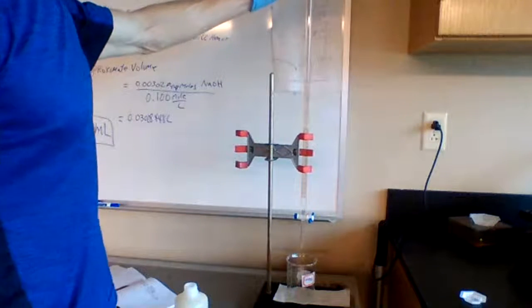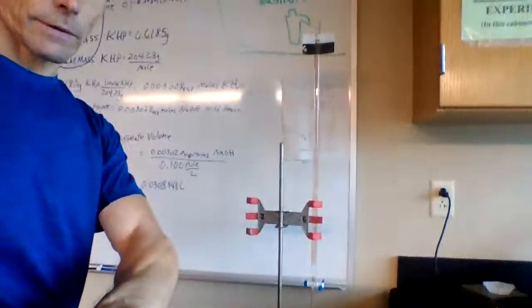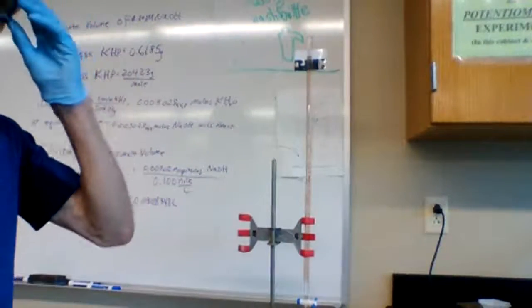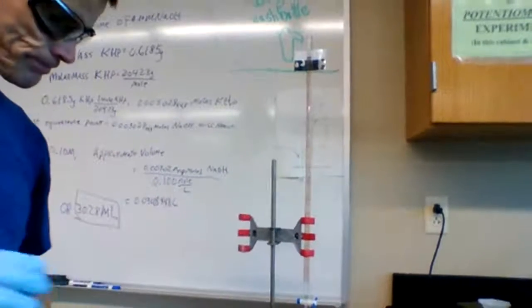Okay, I can stop it, and I would use my burette reading card, if you can see it. I have my burette reading card right at the 0 position. So hopefully everybody can see that. Again, I'll work with you in lab as we go through our titrations. So now let's prepare our sample.